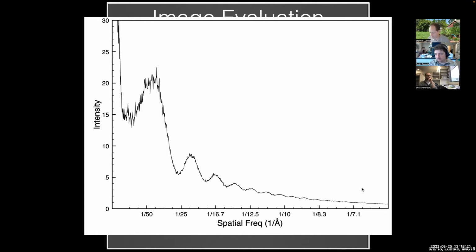While the maximum likelihood theory was derived under the assumption that the noise was flat band random noise, it's not clear whether that's a requirement or whether it was just an assumption. If you got rid of that assumption, maybe maximum likelihood could still be derived as being correct. Anyway, that is one hole in the whole maximum likelihood theory as it's used in CryoEM right now: the noise is not really uncorrelated, and it's not white, and they whiten it and then they just sort of assume it's okay.